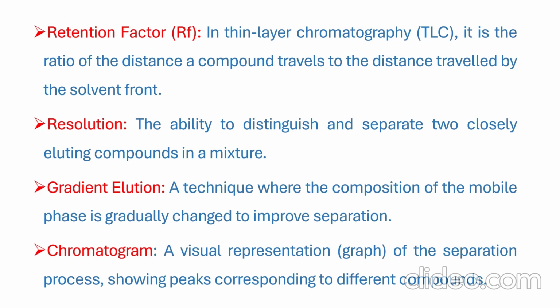Retention factor. In thin layer chromatography, it is the ratio of the distance a compound travels to the distance traveled by the solvent. Resolution is the ability to distinguish and separate two closely eluting compounds in a mixture. Higher resolution indicates better separation.